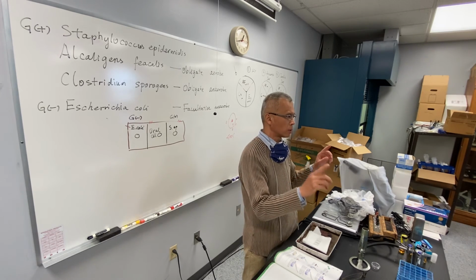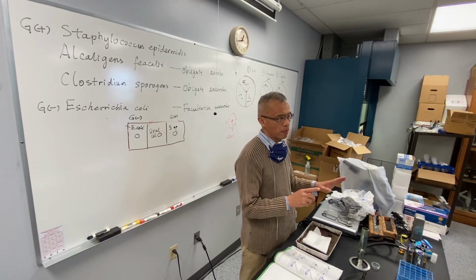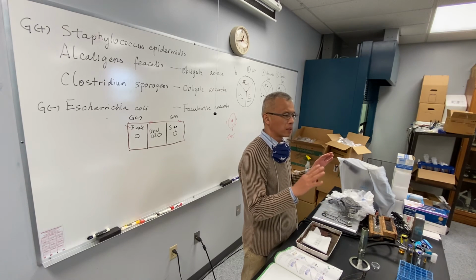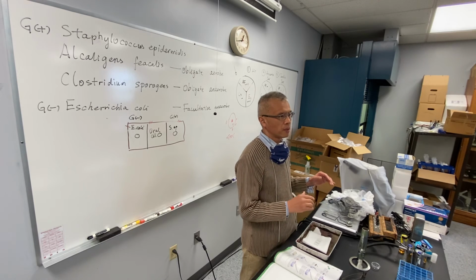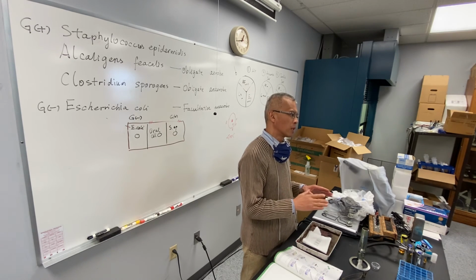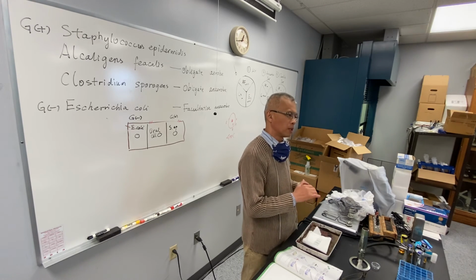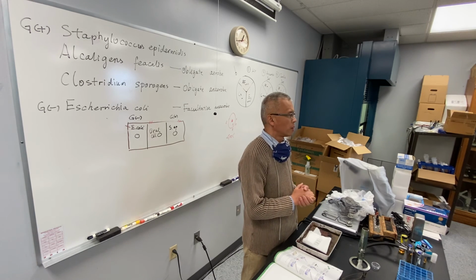First, look at the 2 controls. Gram-positive cells should be purple, and gram-negative cells should be pink. If the 2 controls are not as expected, it means your procedure is not correct. Then you go to see your cells, the cells of normal flora, which is very complicated, a mixture of gram-positive and negative with different shapes, together with your human cells. Right, buddy?